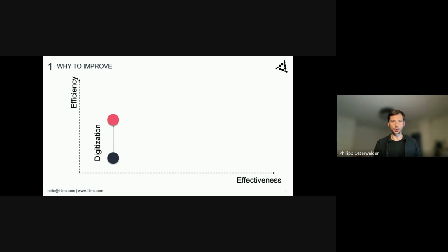Can we make it even shorter? Is this the best way we can deal with this workflow? Or is there any better way to reduce the complexity or reduce the errors in these several work steps? And this is a pretty good question, because afterwards we think of this process optimization before we touch any tool or software or digital solution.